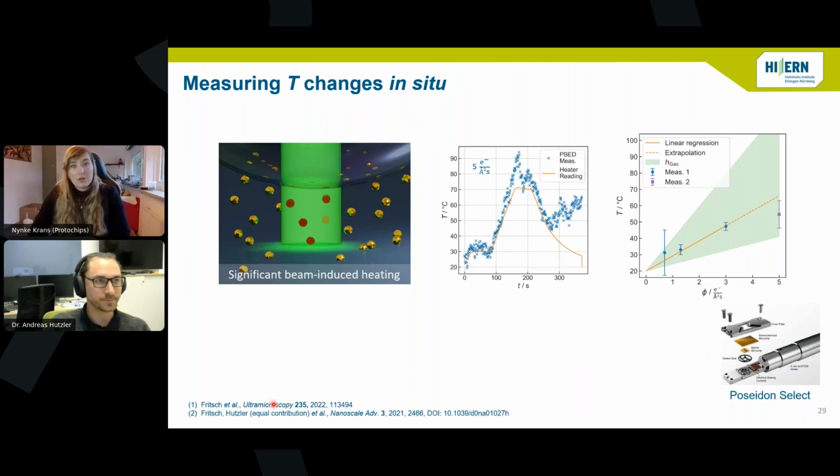So while you are doing these measurements, do you see then any drift as well? Because the temperature change is so big, I would expect that if there is bulging, you would look into the microscope, you see lots of drift on your particles as well.